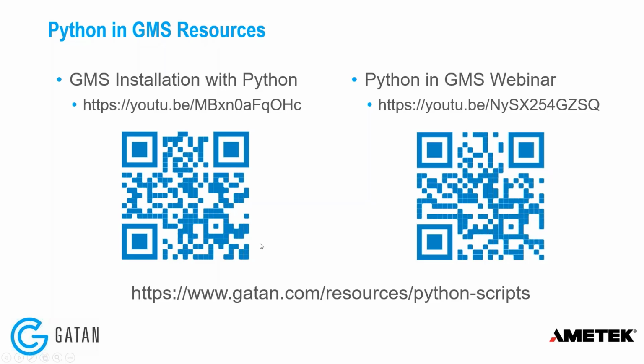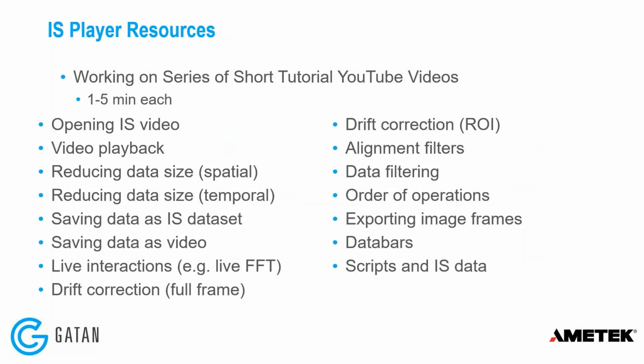We have a video that shows you how to get started, how to install the software with Python. And we also have this web page where there are example scripts, including the one that I showed for live processing of the FFT and processing of the FFT of an IS dataset.